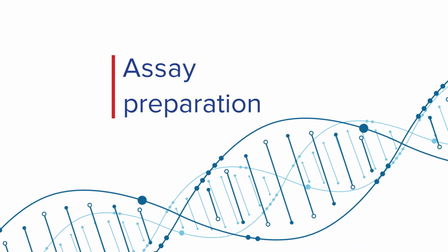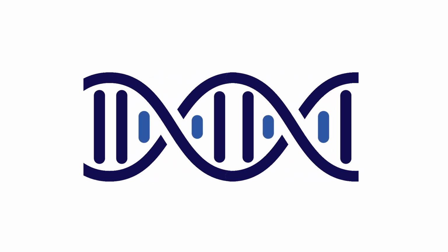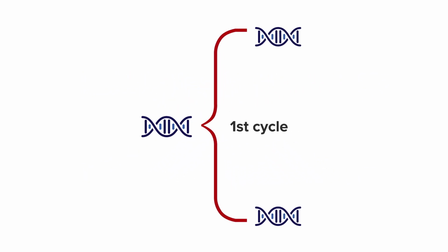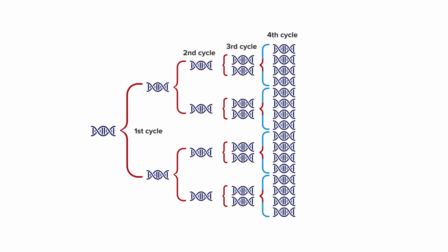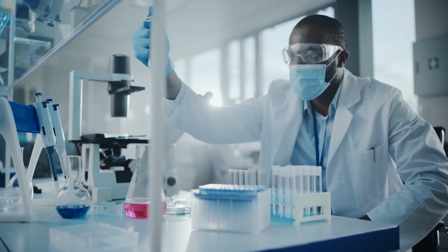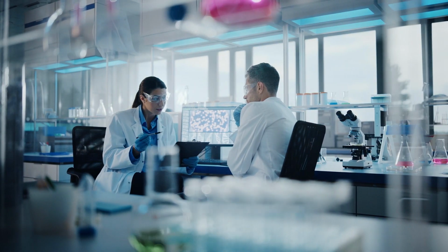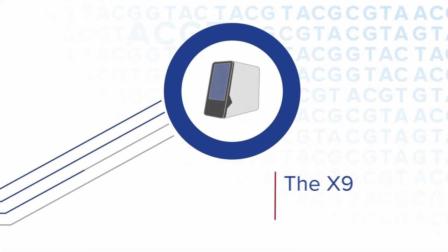Assay preparation. Once your assay panel has been designed, nucleic acids are extracted from your sample. Preamplification is performed to ensure that sufficient copy numbers of the targets will be interrogated in the IFC. You can then prepare master mixes, samples, and detection assays. Workflows offer the flexibility to preamplify samples off IFC, or you can integrate automated preamplification on certain IFCs within the X9 system.